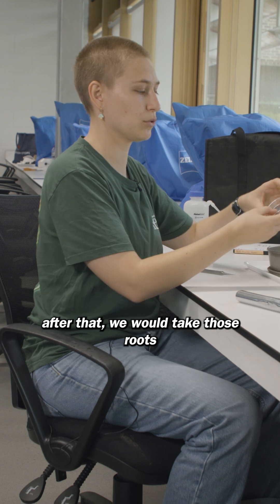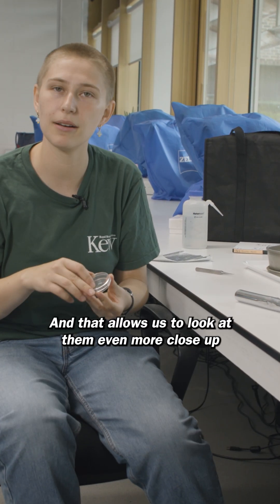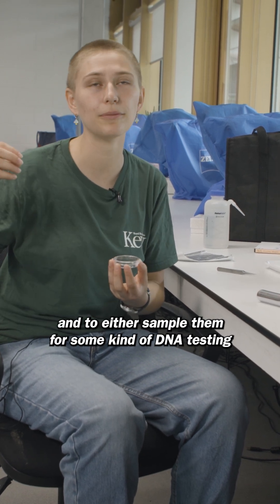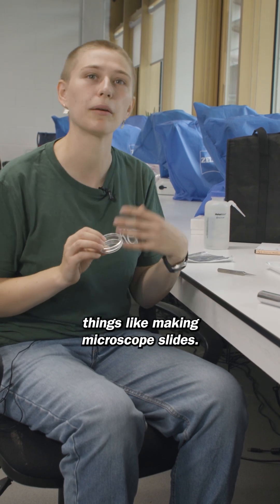We would take those roots and put them into a dish like this — a small petri dish — and that allows us to look at them even more close up and to either sample them for some kind of DNA testing or to sample them for other things like making microscope slides.